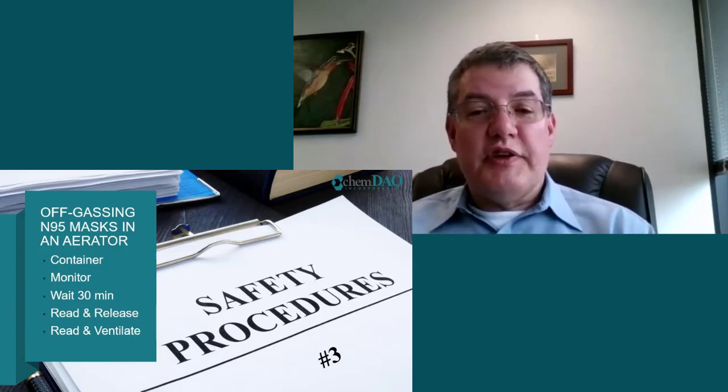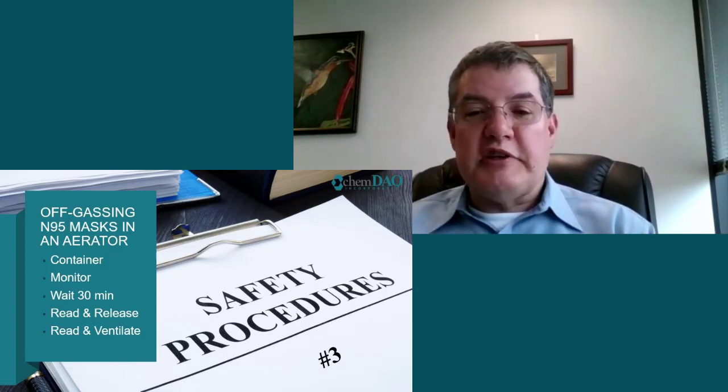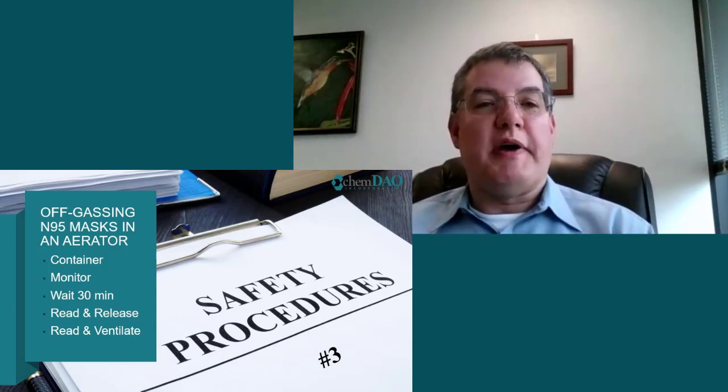However, a facility can use a different value if their risk management committee reviews the available data and, using a documented procedure, determines that a different value would be better.